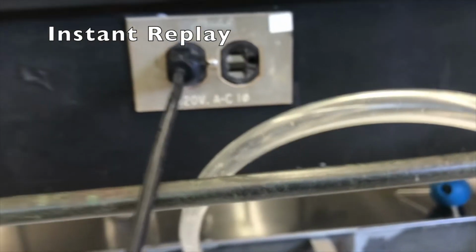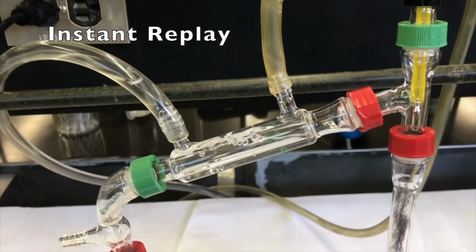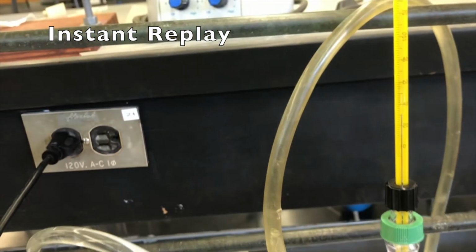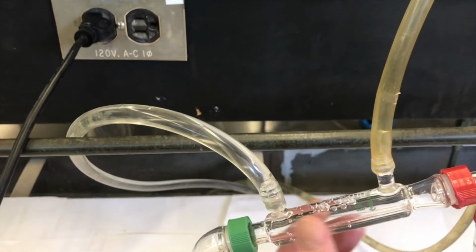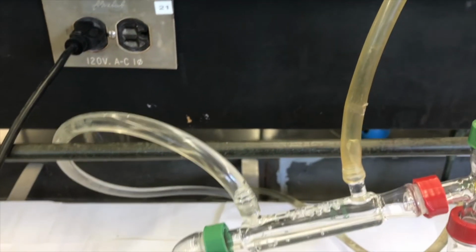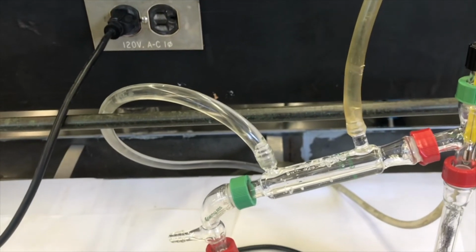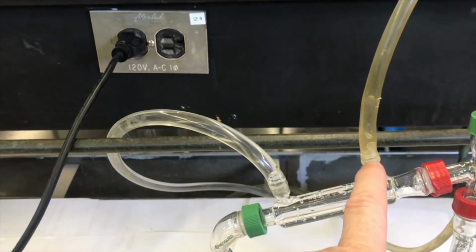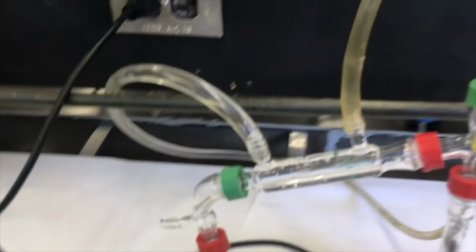It comes around, and it's going to fill up and then drain out. That is going to be plenty of water, and this water is continually coming through to cool this. That's going to be plenty of water for us. If I have the water on higher, I'm just wasting more water, and even more importantly, if I have it on high, it's more likely to push these off and have water everywhere, sun splash.